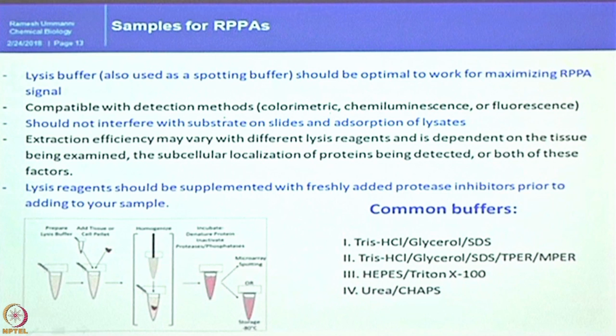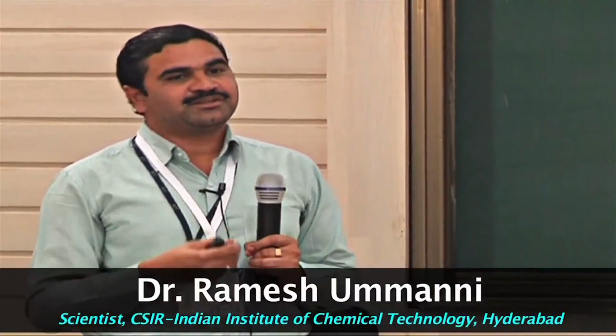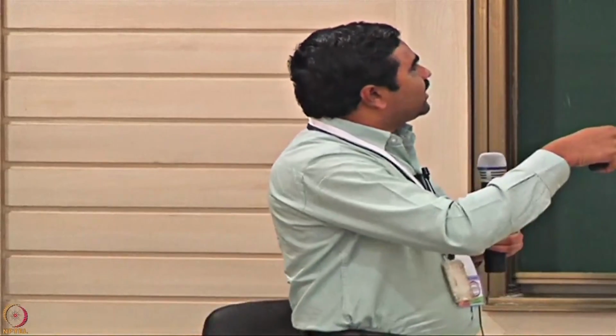Extraction efficiency may vary with different lysis reagents and is dependent on the tissue being examined. Let us say, for example, if you are taking a prostate tissue, some stones will be there, then you need a stringent buffer. If you are lysing cell lines, simple RIPA buffer is sufficient or MPER buffer is sufficient. The lysis reagent should be supplemented with freshly added protease inhibitors. Of course, if you want to understand post-translational modifications, you need inhibitor cocktails like phosphatase inhibitors and also some protease inhibitors so as not to degrade the protein of interest.